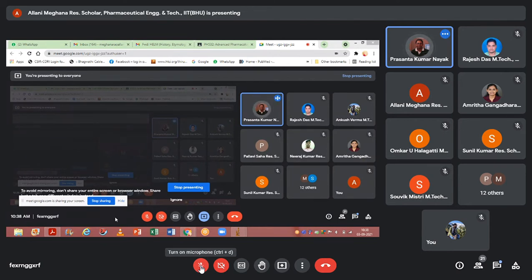So what happens in the computer is that if there is even a little bit of difference, a wavelength difference, it considers it a different color. If there is a little bit difference, then it will see the difference in wavelength, it will be a different color. Okay, so in this particular image, if you are fixing 256 colors maximum, then in all images you are fixing it, so there is no bias of colors. Are you guys getting?